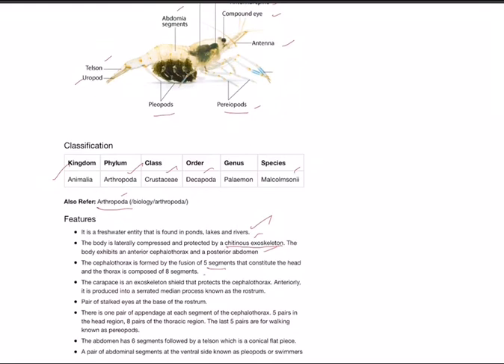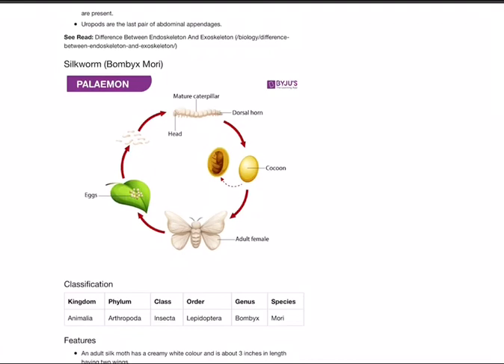The body exhibits an anterior cephalothorax and posterior abdomen. The cephalothorax is formed by fusion of five segments of the head and eight segments of the thorax. The carapace is an exoskeleton shield that protects the cephalothorax. It has stalked eyes at the base of the rostrum. There is one pair of appendages at each segment. The last five pairs are for walking, known as periopods. The abdomen has six segments followed by a telson. Pleiopods or swimmers are present, and uropods are the last pair of abdominal appendages.